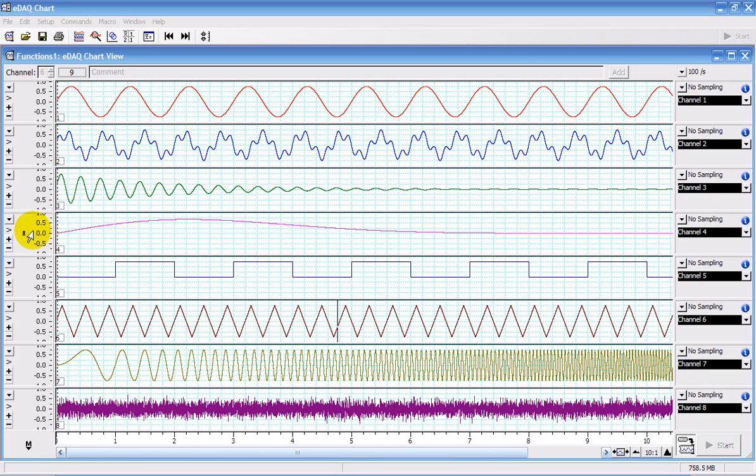You can use the Spectrum window in the chart software to show the intensity of the various frequency components of a signal.